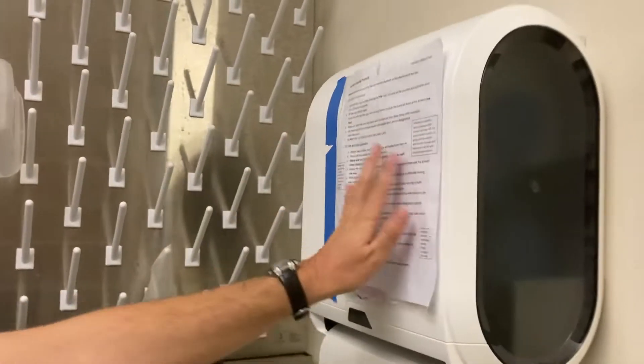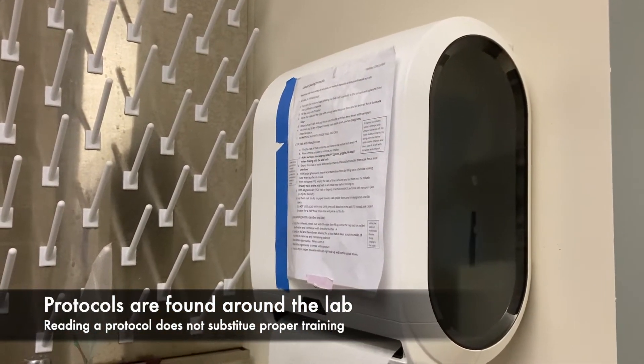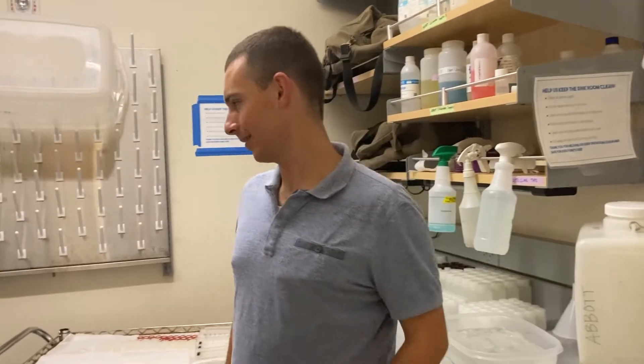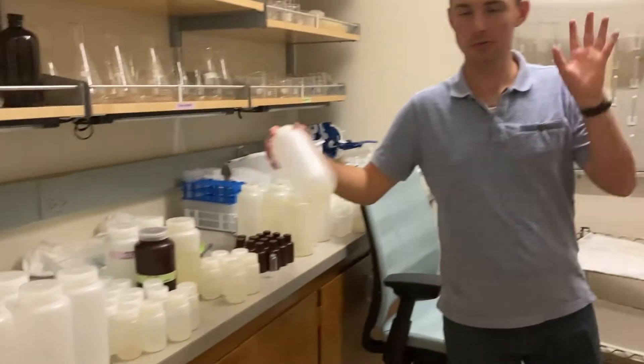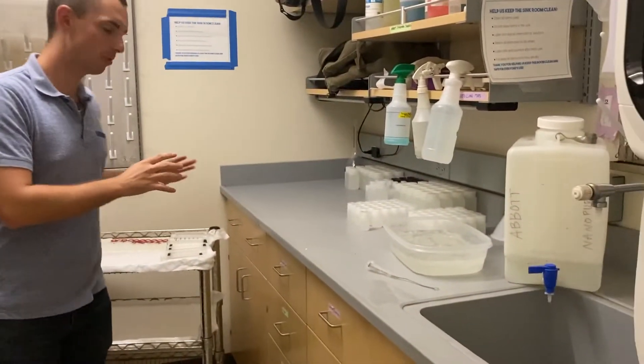Up here is a protocol sheet. This will tell you how to clean everything in the lab. If you have questions, please reach out to somebody, especially the managers — no questions are bad. To remember: if you're touching dirty things, no gloves are fine. However, once things are clean, please wear gloves.